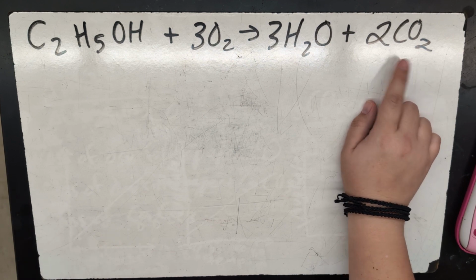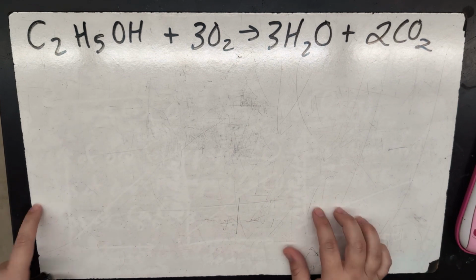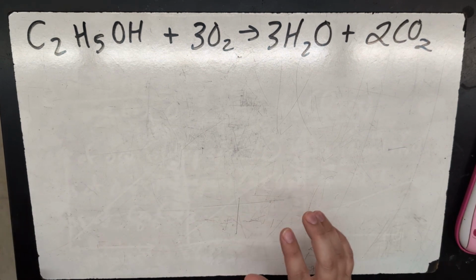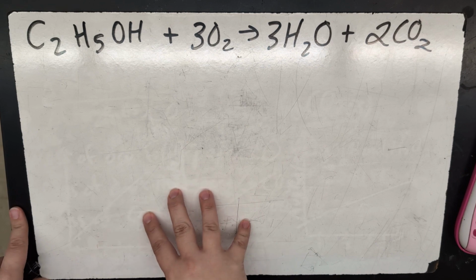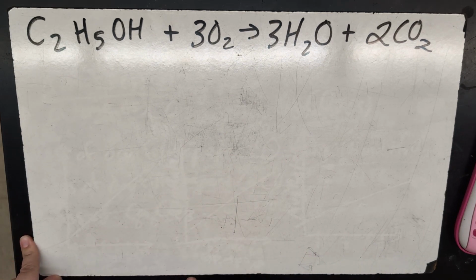The results on this lab are not great. There's a huge margin of error for this one due to the nature of the experiment, which we're going to look at. But it's still a nice, fairly quick experiment to run, and there have been questions on this type of experiment on the AP exam in the past. So it's a good one to make sure to do with the students.